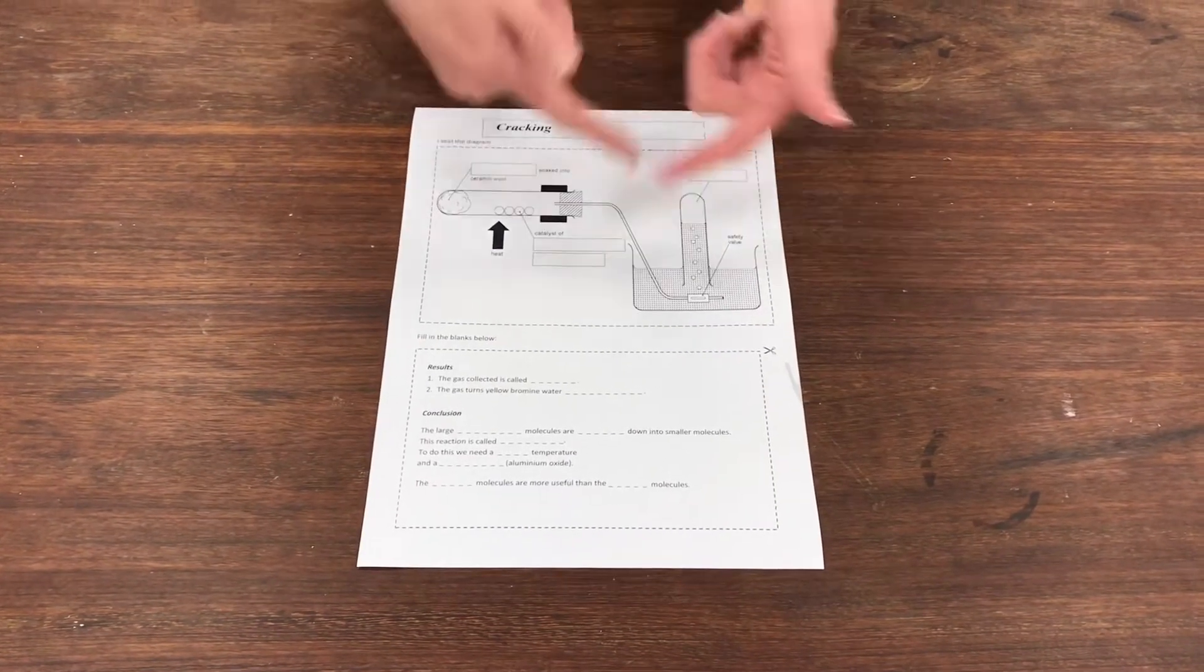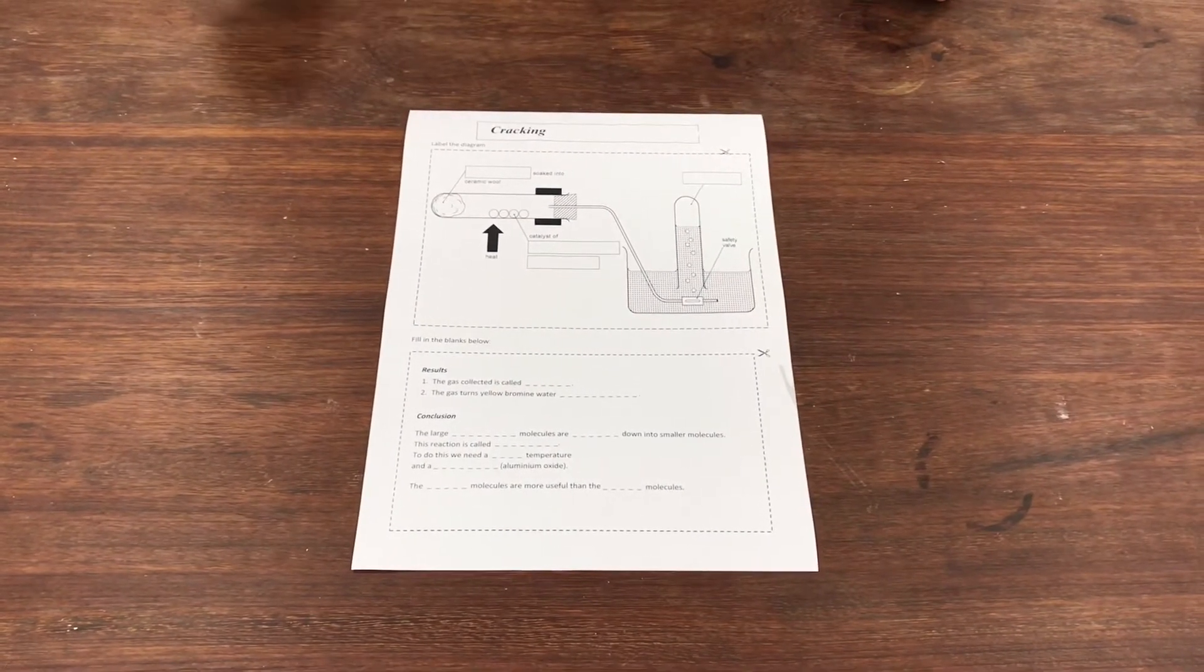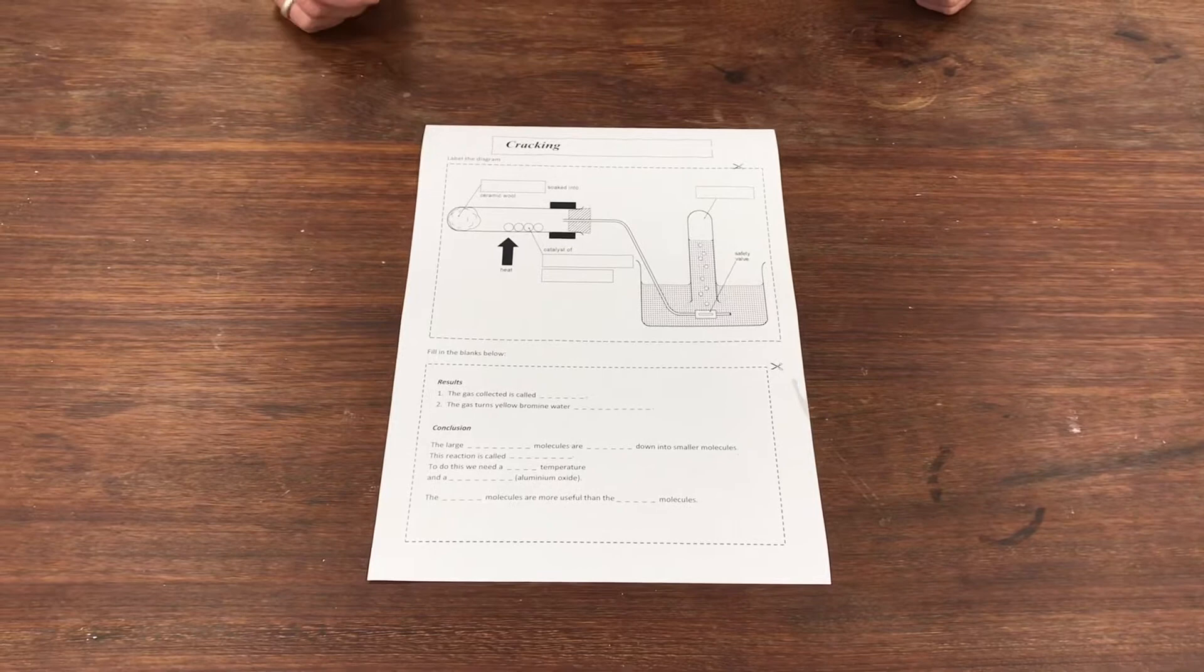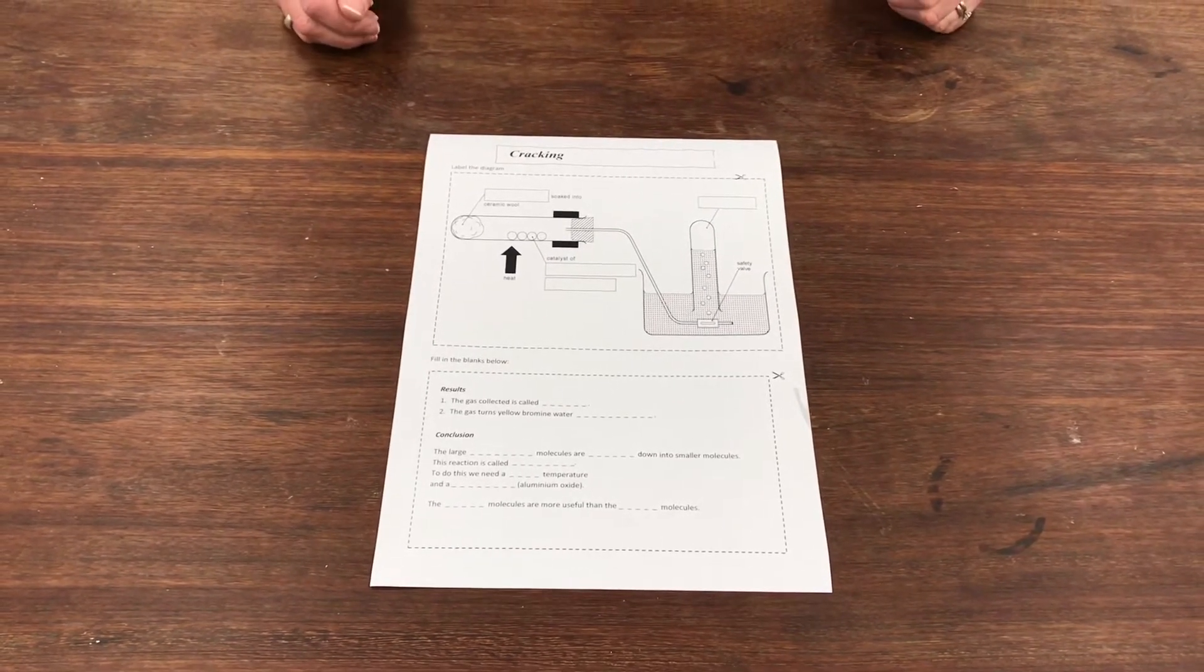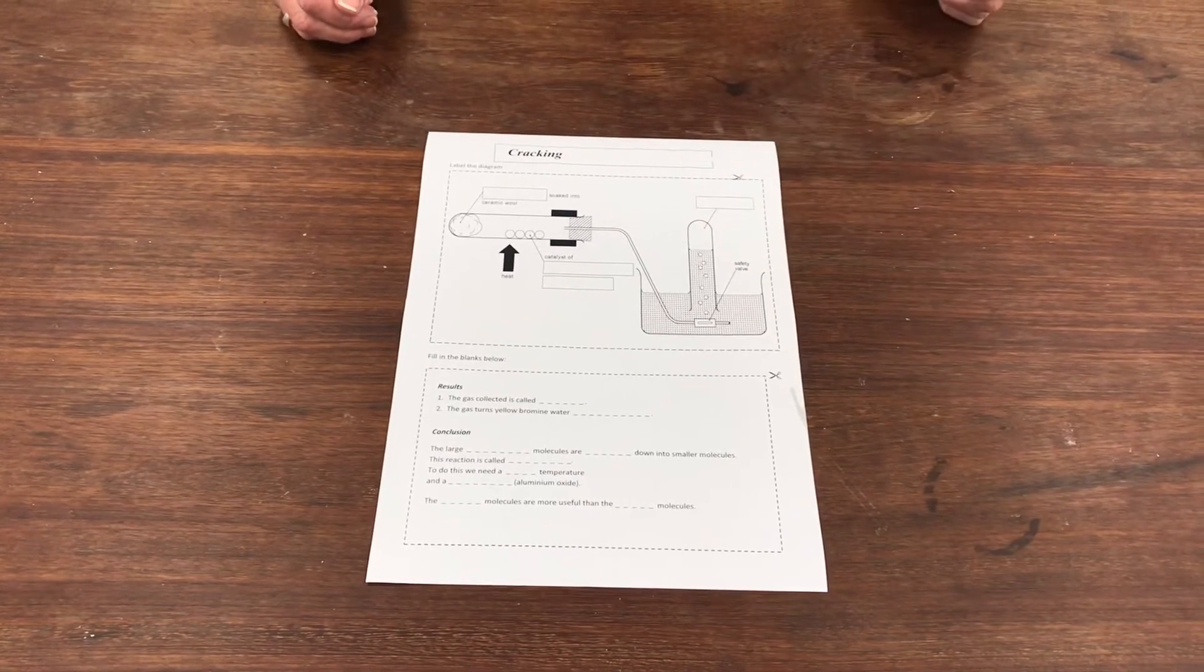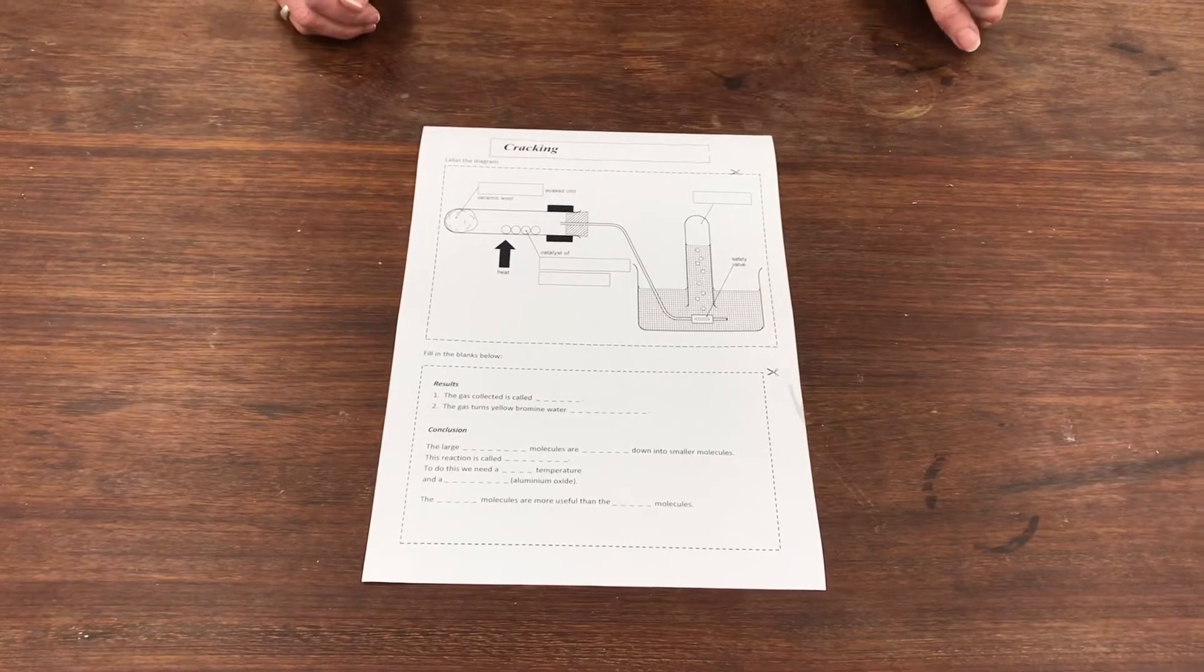and we react it using this sort of apparatus here. During the experiment the long alkane molecule is going to be broken up into smaller molecules, two different sorts of smaller molecules. We'll be collecting one of them in the test tube at the end of the apparatus and we can test that later to find out what kind of a molecule it is.